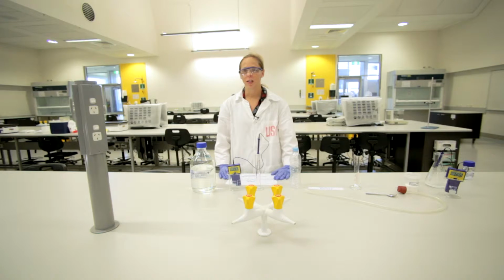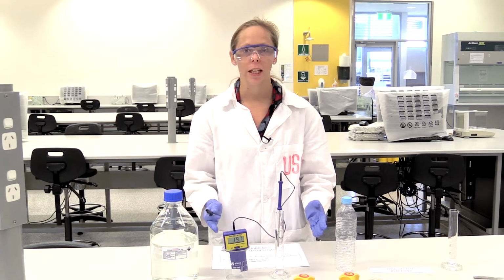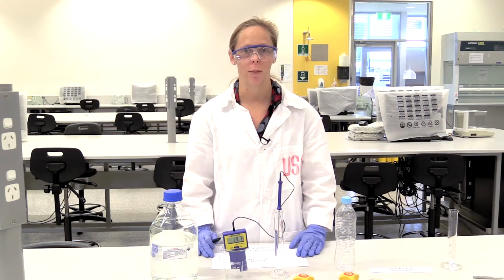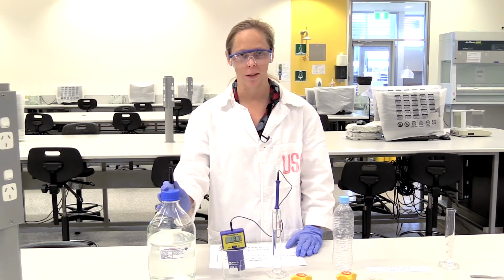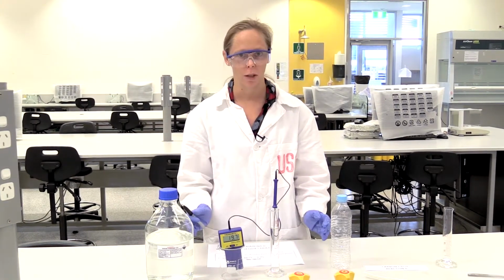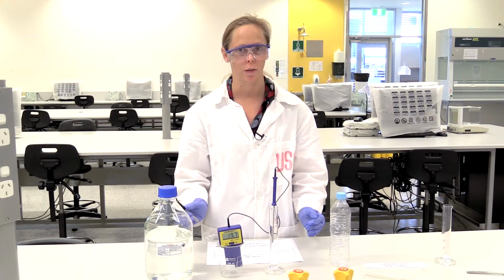So one of our largest challenges that's presented to us is trying to sequester carbon dioxide from the atmosphere. So this today is one example of how to sequester carbon dioxide from the atmosphere. Of course, sodium hydroxide is quite expensive, so this is only in experimental form at the moment, but it at least represents a possible solution for the future.